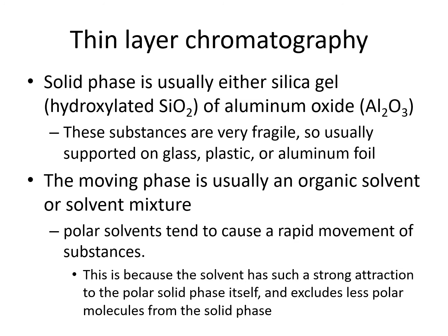It is paper chromatography, where water is acting as a stationary phase and any solvent or mixture of solvents will be a mobile phase. So it's not like a usual paper. Paper chromatography uses a special kind of paper for this technique.